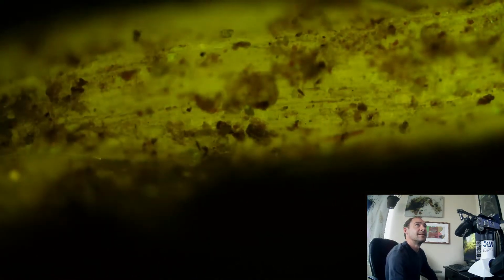A little bit more focus. Oh yeah, so after this is going to be blueberry. Then we're going to look at a young tomato root. Right now we're looking at raspberry. Pretty interesting looking. I wonder if I lower the ISO a little bit, if we can see just a little bit more detail in this root. It's glowing very brightly.